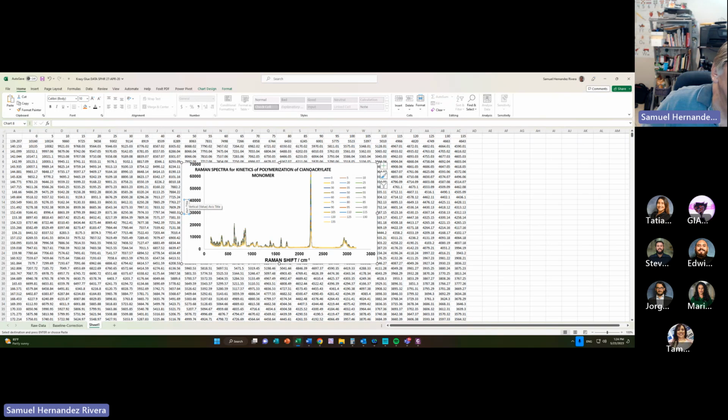This is harder because it's slanted. It's very vertically up, but it's okay.